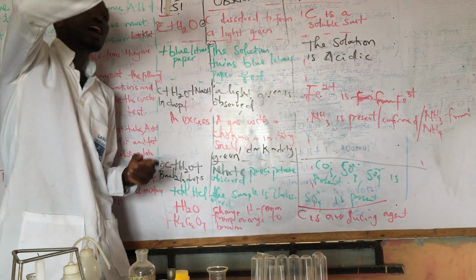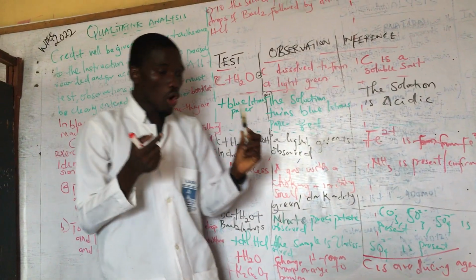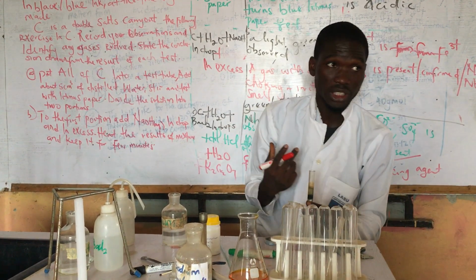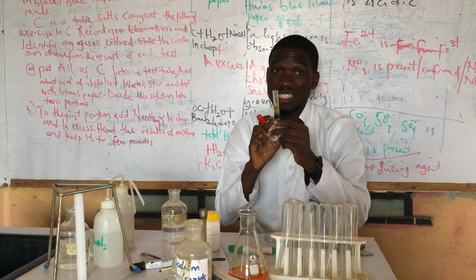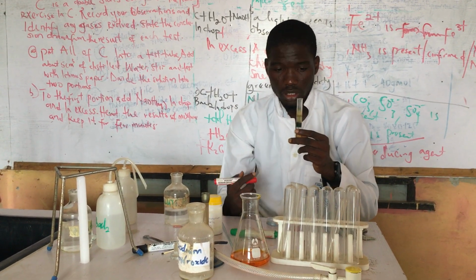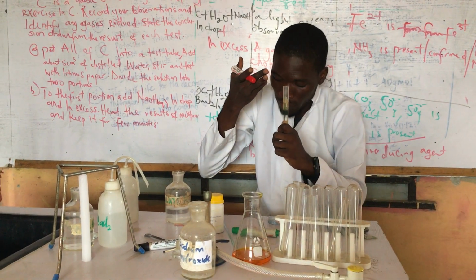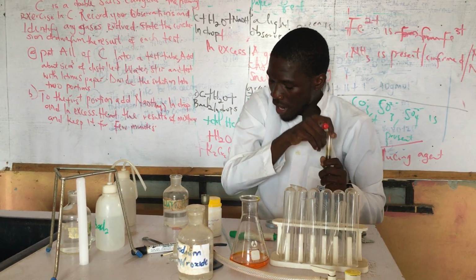So now, after a few minutes, we have a brownish color here. So, telling you guys that we have checked for the smell, either choking or irritating. Are you with me now? So the color is what? Before leaving it, it is a dirty green or a dark green. So when you drop it for a few minutes, at the top layer of the test tube, we have a brownish color there.